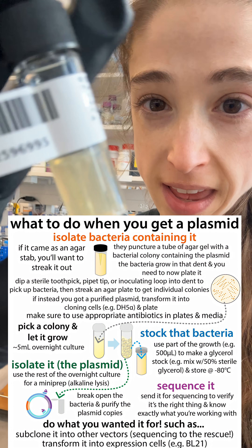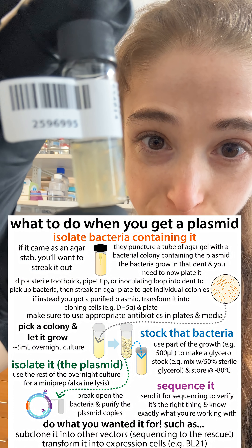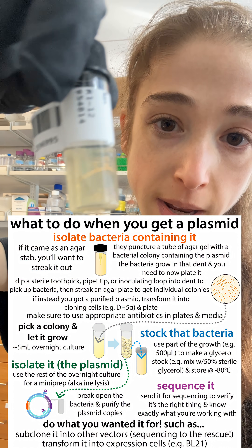Sometimes when you order a plasmid, they actually come as these agar stabs. You can kind of see there's that pipette mark — what they do is they take a pipette and basically stab the agar with bacteria that contain the plasmid.